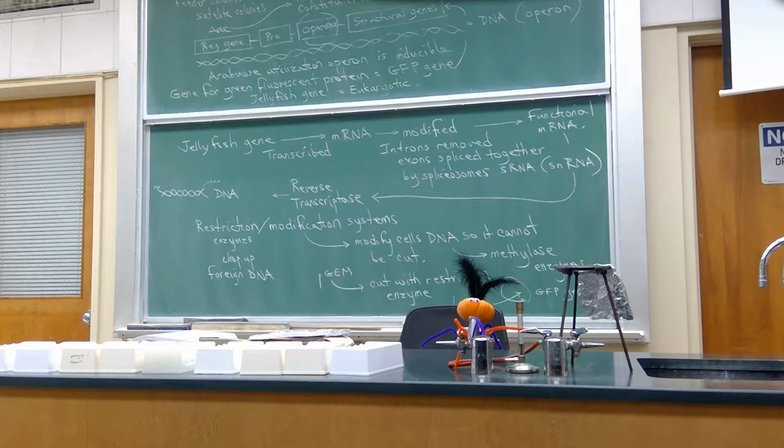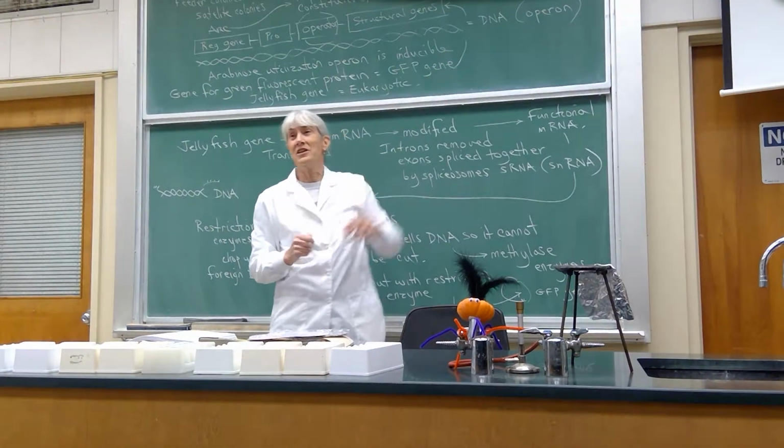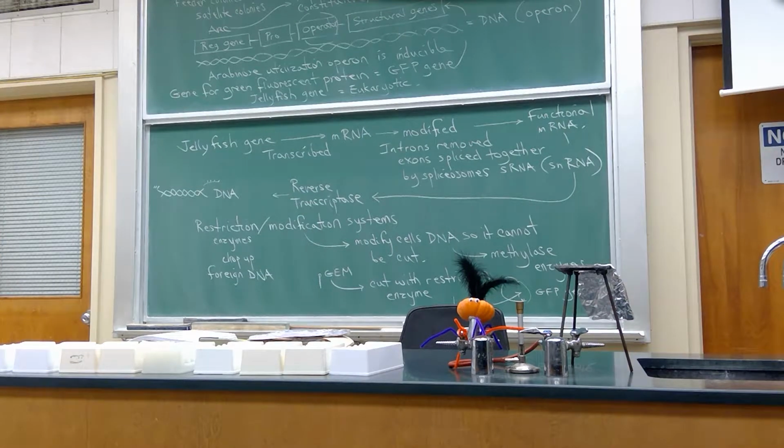Where would we find that out? On that plate. Does anybody know about fluorescent molecules? If you want to see fluorescent molecules, what do you have to expose them to? Black light. They're fluorescent. They'll only show under UV light.